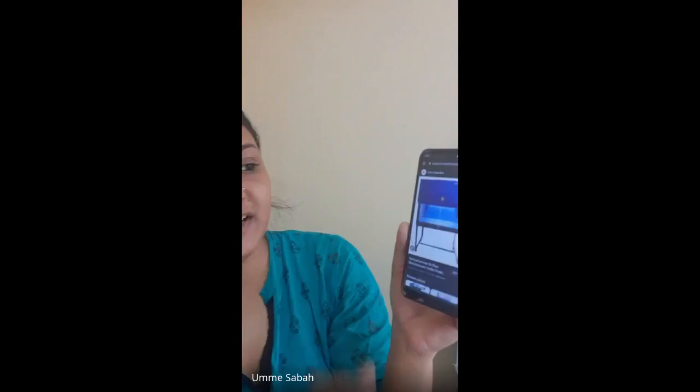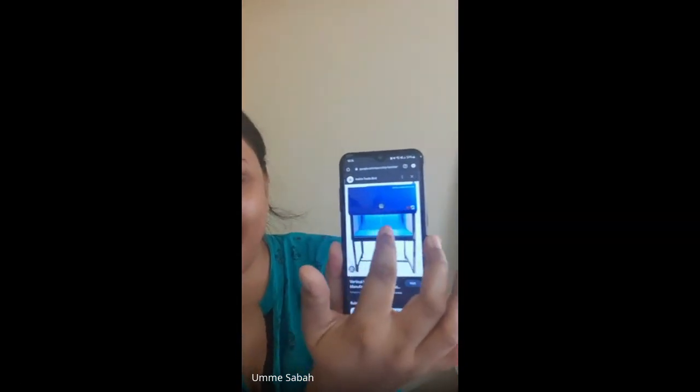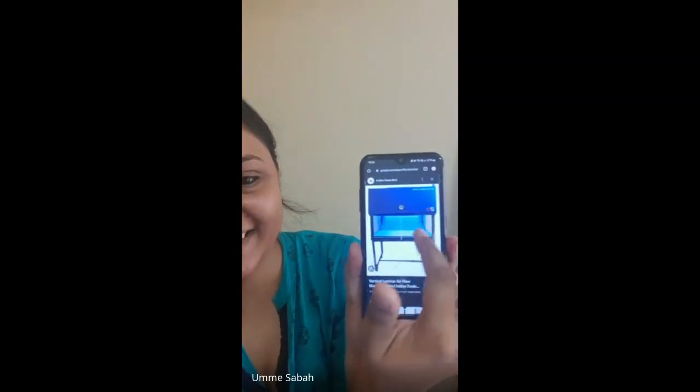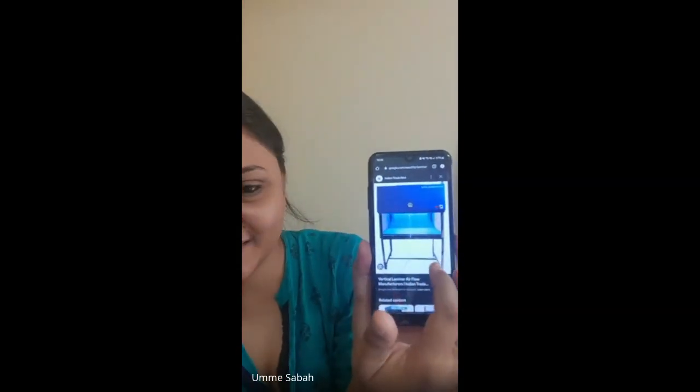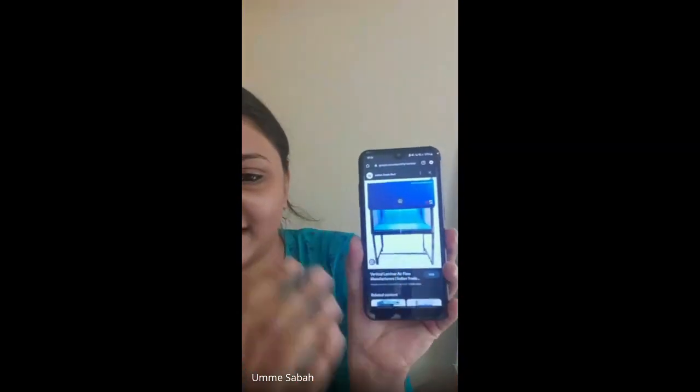Okay, ma'am. Okay. So here we sit inside. Sit inside means we will be outside. Only our hand and head will be inside. We will not go inside. We will be sitting on a stool. Only the hand and head will go and we'll be working inside. So that is what I mentioned. And then I want the autoclave.